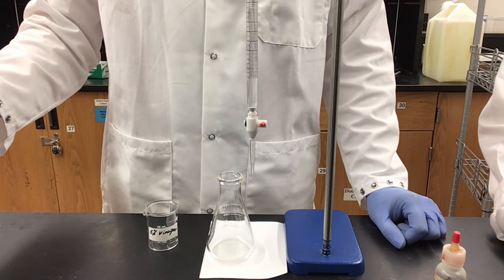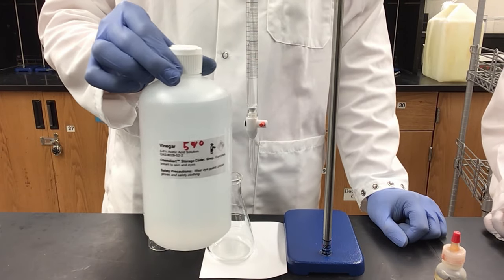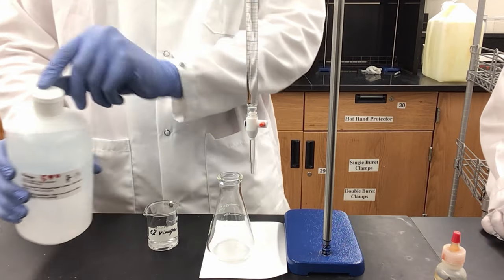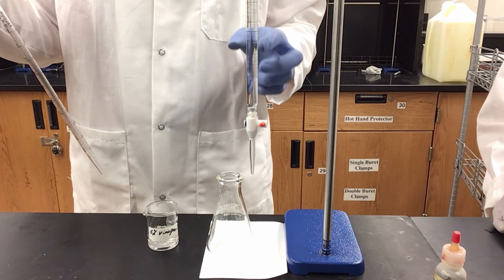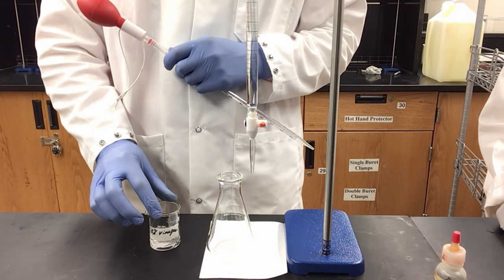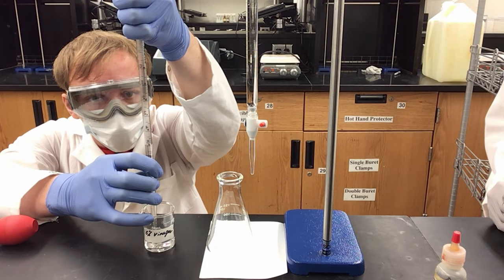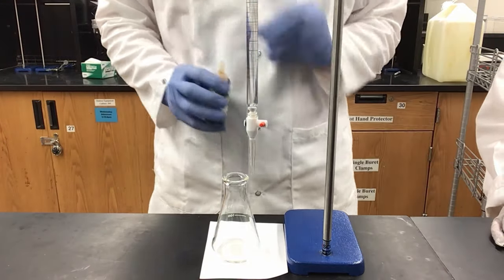In this next part we are investigating the acid content of consumer products, starting with vinegar — acetic acid. We have a five percent vinegar solution here; this is approximate and we don't know the exact concentration, which is why we are titrating it with our now standardized 0.1 molar sodium hydroxide. We want to use about 40 milliliters of sodium hydroxide, so through our calculations we have determined we need to use about five milliliters of vinegar.